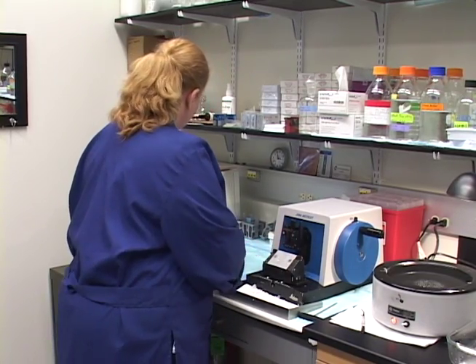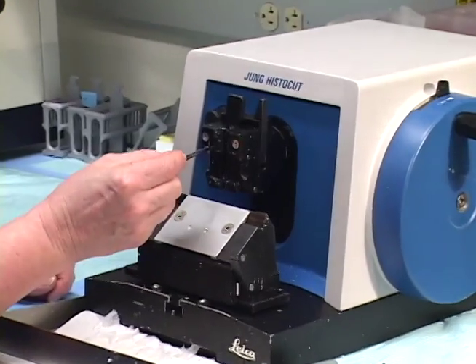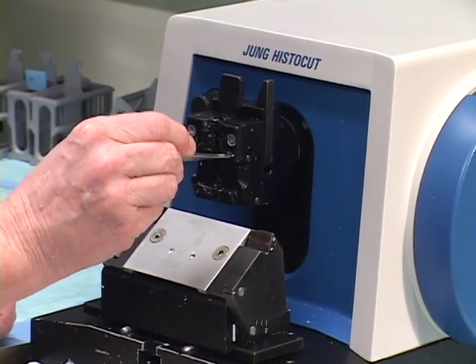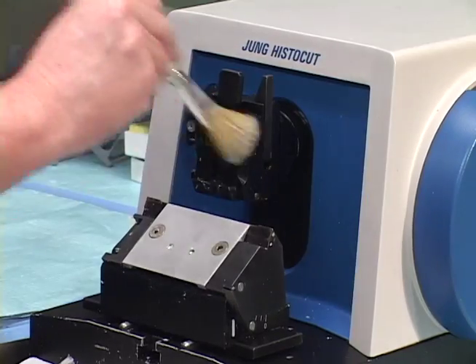I'm going to clean out — I take some forceps and I clean off the extra paraffin here. Extra paraffin also gets up into these crevices and that affects the way the block seats into the chuck here. So you can get all that off. Then you take the brush and give it a good brushing.